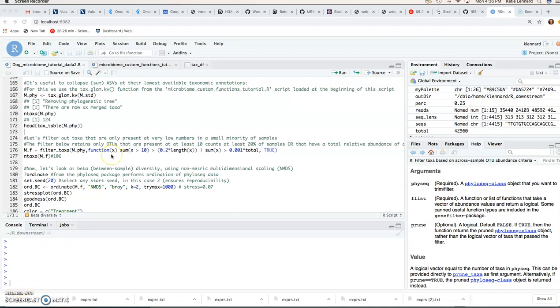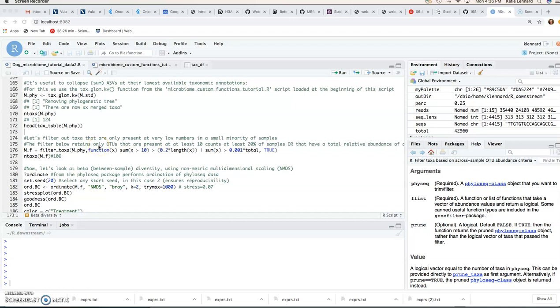In the previous video lecture, we collapsed our ASVs at the lowest taxonomic annotation for use downstream with the tax glom function, and we also filtered that phyloseq object just to get rid of really low-level OTUs that we're not interested in looking at.